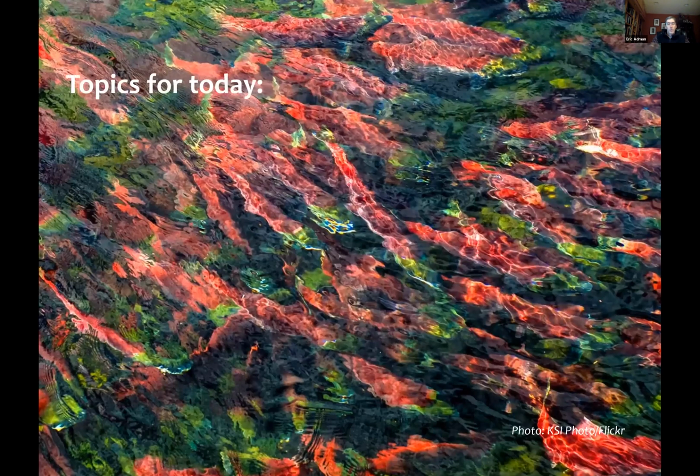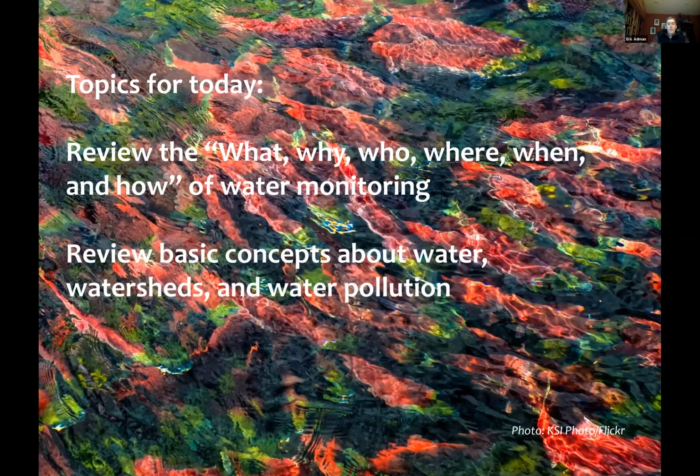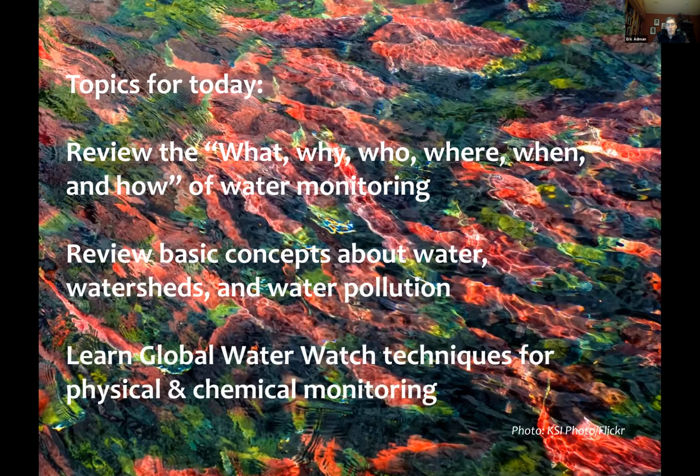So what we're going to go through this evening, just briefly touch on again, the reasons behind water monitoring, talk briefly about some basic concepts about watersheds and water pollution, and then spend the bulk of the class on learning Global Water Watch techniques for physical and chemical water monitoring.